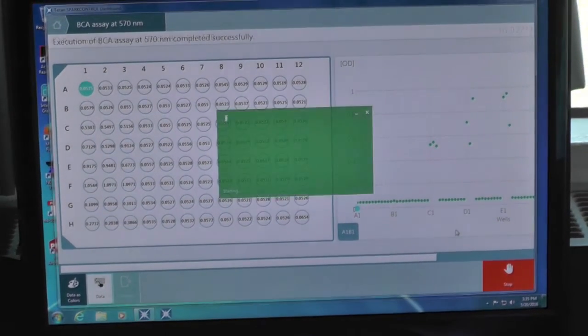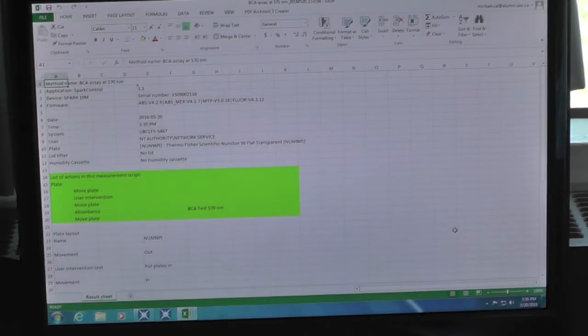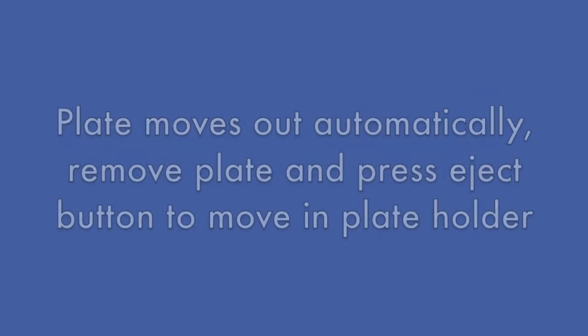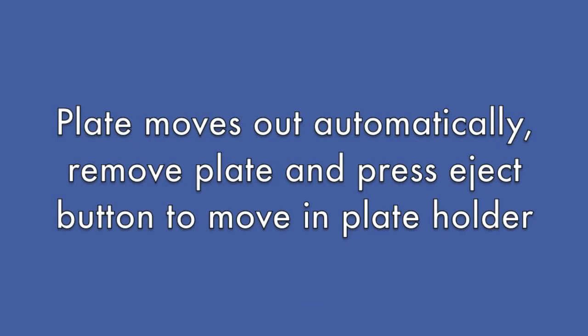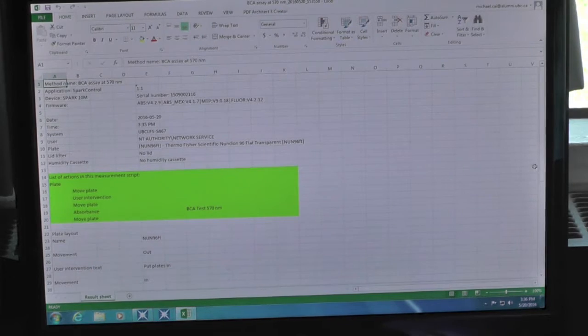At the end of the run, your plate will be moved out. Remove the microplate from the instrument. Then manually press the eject button on the instrument to move in the plate holder.